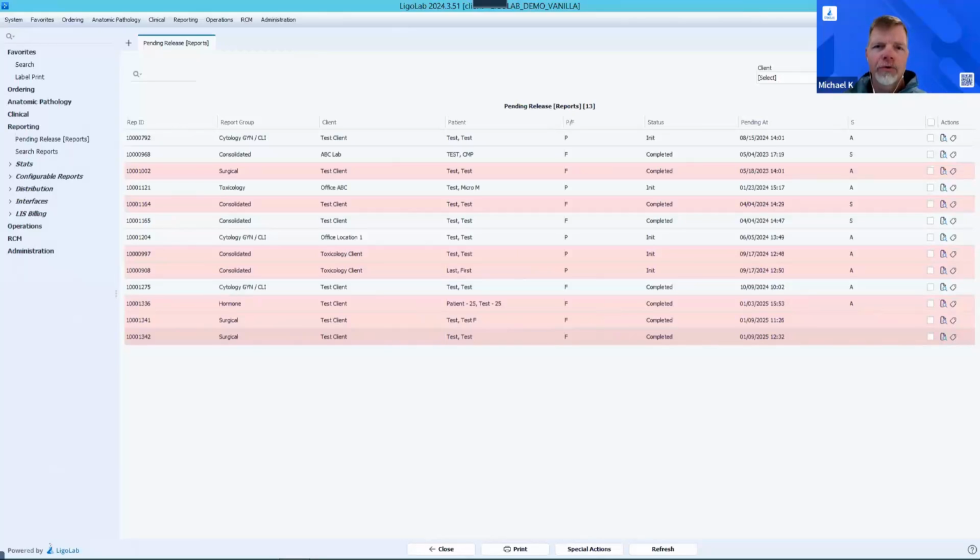Approximately how many third world country clientele do you currently facilitate, and how would you describe their experience with your platform? Yeah, I can take that one. I was already typing an answer. So I would say that definitely the majority of our labs are in the US. We've got several labs serviced in the Middle East and Australia.